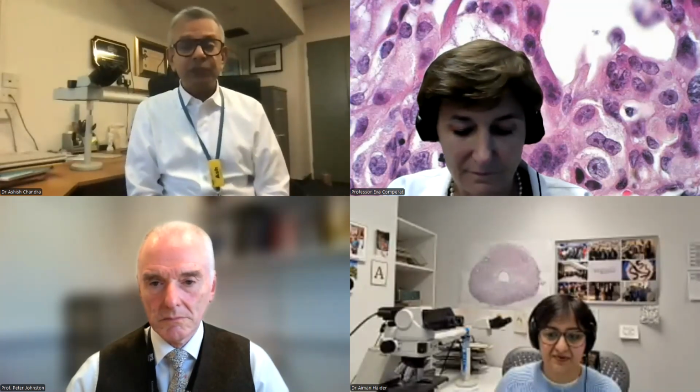And this really just allows the fixation of the tumor to start as early as possible and to give us good morphology, which is so important for grading of urothelial tumors. So we really encourage the early fixation and exposure to formalin. And this particularly gets around the issue of receiving a cystectomy specimen on a Monday morning that was done on, say, Friday afternoon, and the tumor's been autolyzing away all weekend. By the time you open it on Monday, it's already mush.